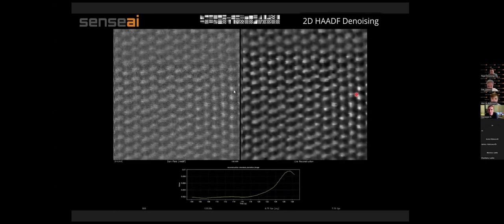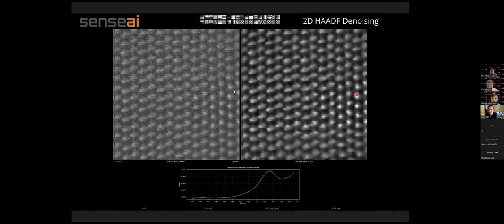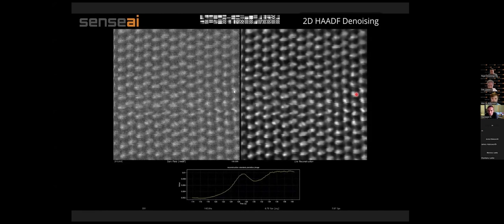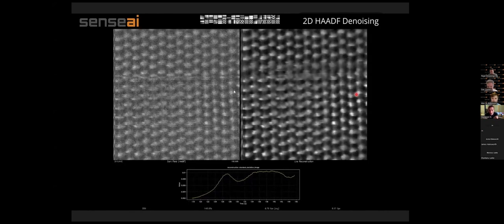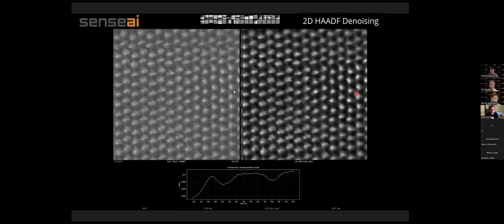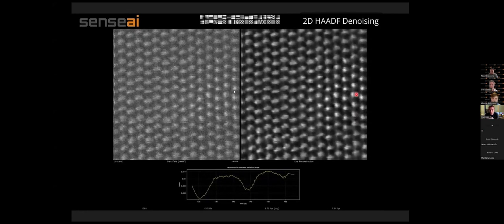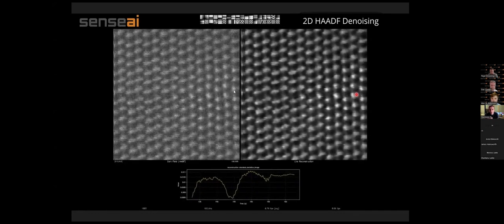Oh yeah, thanks Alex for asking. I was really very impressed by the speed of the reconstruction. As you can see here, there's a very nice atomic reconstruction. For the operator on the microscope, it's really important to have a very reactive system, especially when you are tuning the parameters of the microscope, such as stigmatism and focus, so you need very fast feedback.